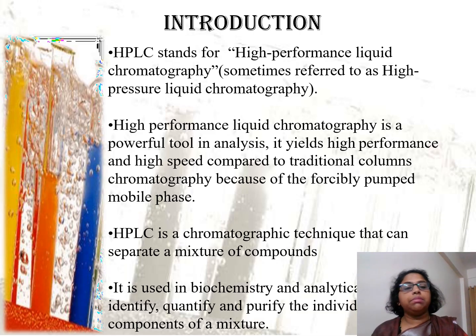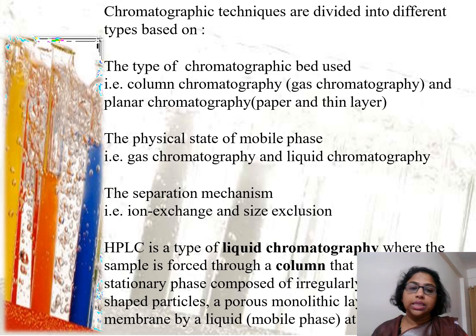So unlike a simple chromatographic technique like paper or TLC, that is thin layer chromatography, this technique is very useful because it can analyze, it can identify, it can purify, as well as quantify the individual components in a mixture. So let us see what this particular type of chromatography is.